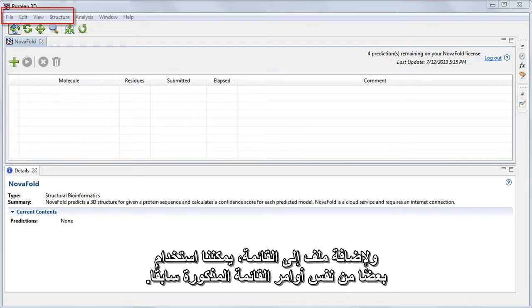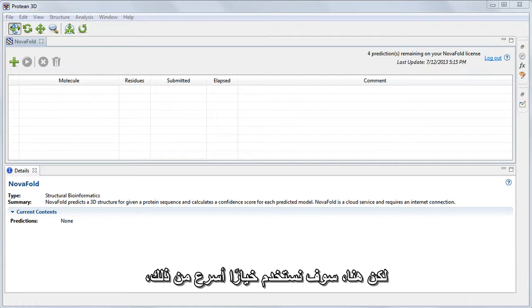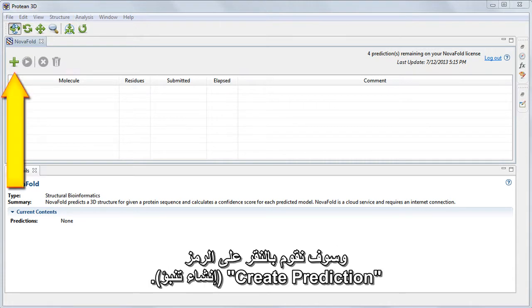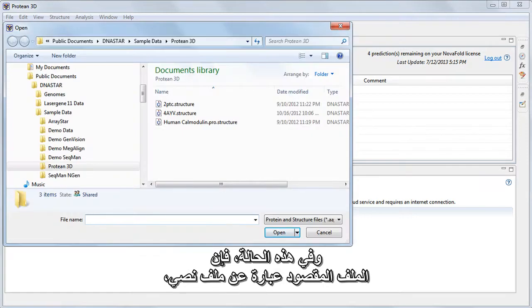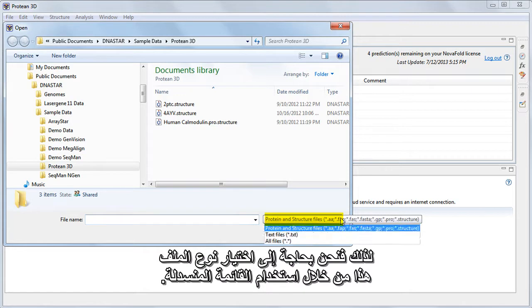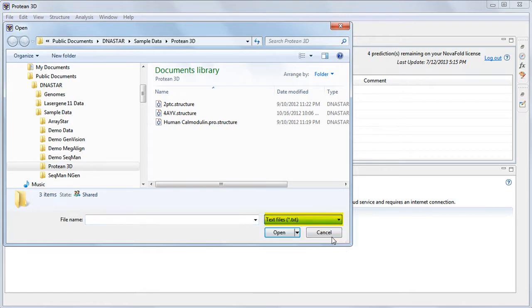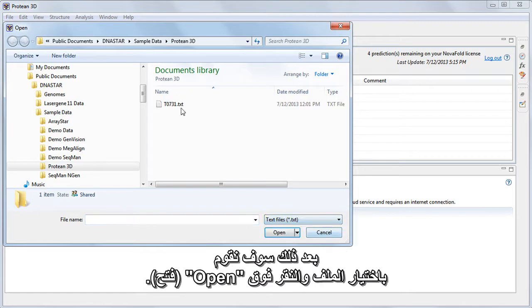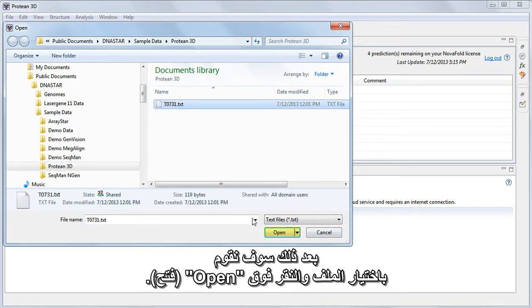To add a file to the list, we can use some of the same menu commands mentioned earlier. But here, we'll use an even quicker option and just click the Create Prediction icon. In this case, the file of interest is a text file, so we need to choose that file type using the drop-down menu. Then we select the file and click Open.